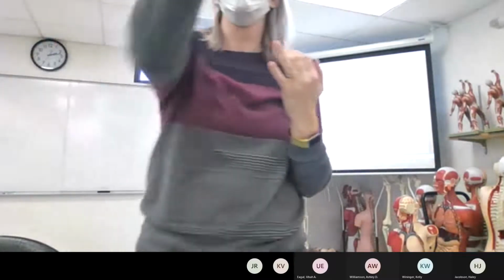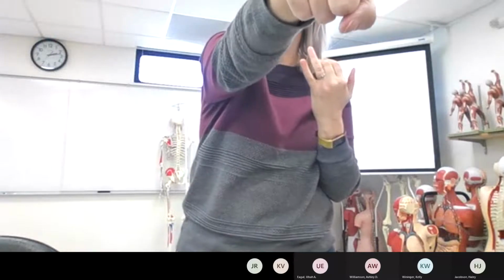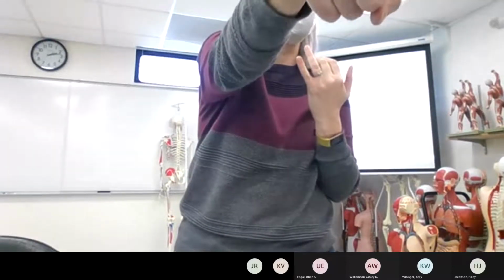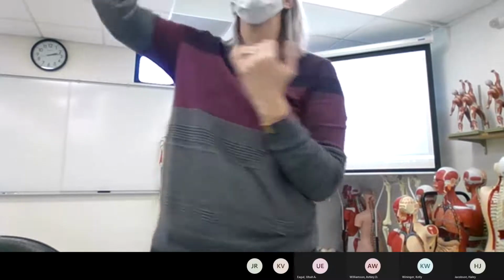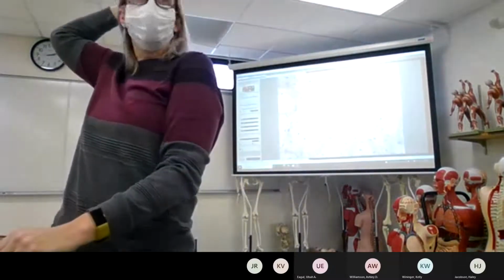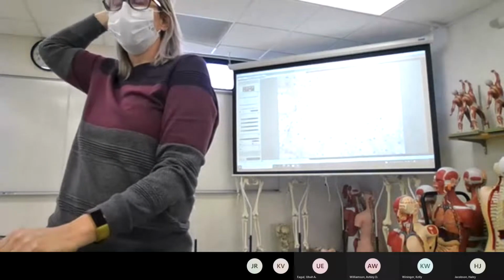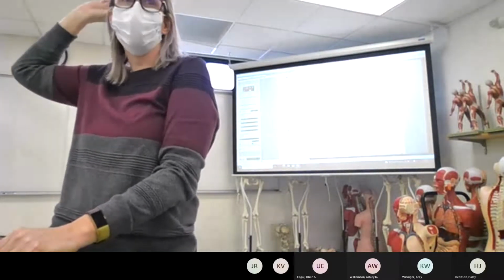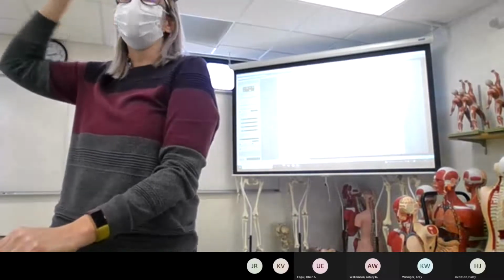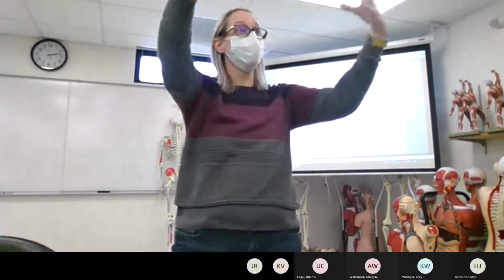So now you've seen a place where it's on the model, on the kidney model, the proximal and the distal tube has simple cuboidal. We're seeing proximal and distal tubes in our slides. So again, another place where we have simple cuboidal. Okay, and then you have your pictures from your book and your lab manual with simple cuboidal.